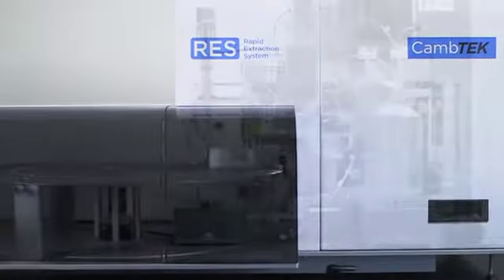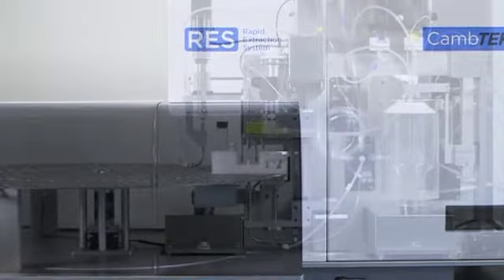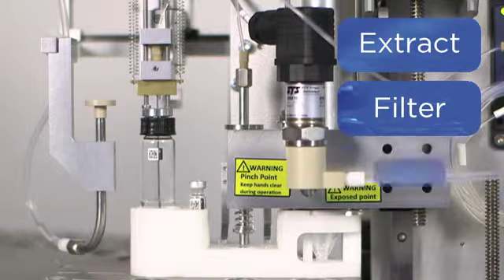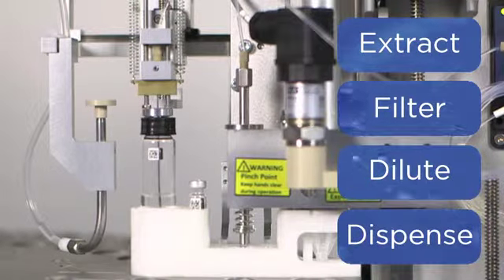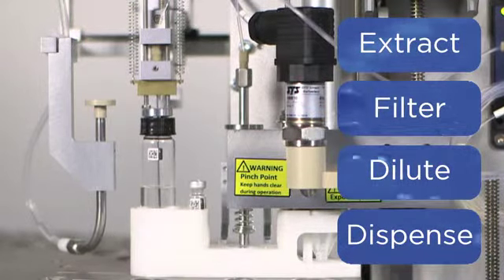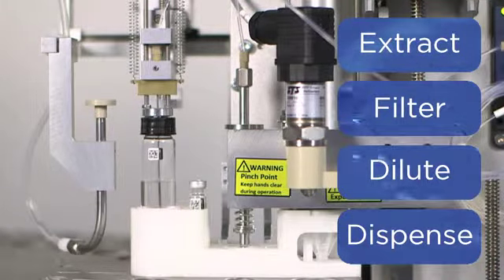Using turbulent fluidic flow, the RES will quickly extract, filter, dilute, and dispense the sample into a sealed 20 mL primary sample vial, or HPLC vial, ahead of testing.